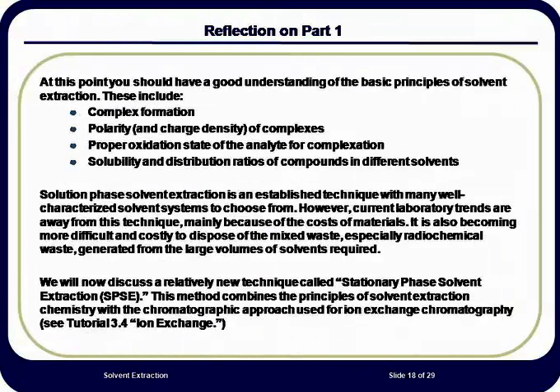The technique of solvent extraction has been used for a long time, and it is very effective at separating radionuclides from interfering ions. The process is based on the formation of a low charge density or neutral complex that will have a higher solubility in the organic solvent than it does in water. When the two solvents are adequately mixed, the complexed ion will migrate to the phase where it has the higher solubility. The empirical function that identifies the extent of this migration is called the distribution ratio.